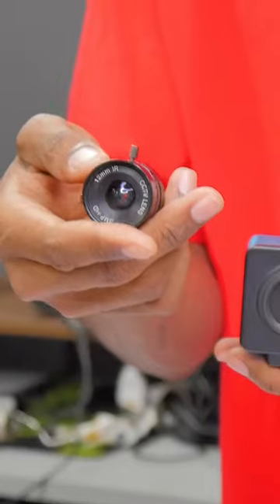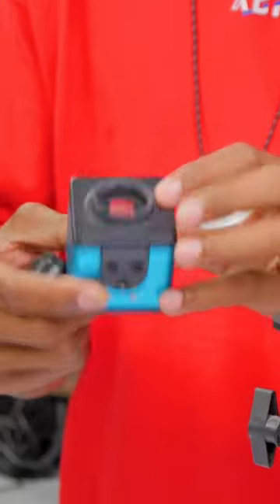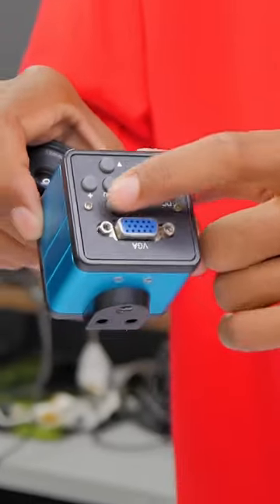You can change the type of lens over here. We've got a 12 millimeter lens, your sensor, a VGA port, and a menu button. For those of you that study electronics, this will come in very handy.